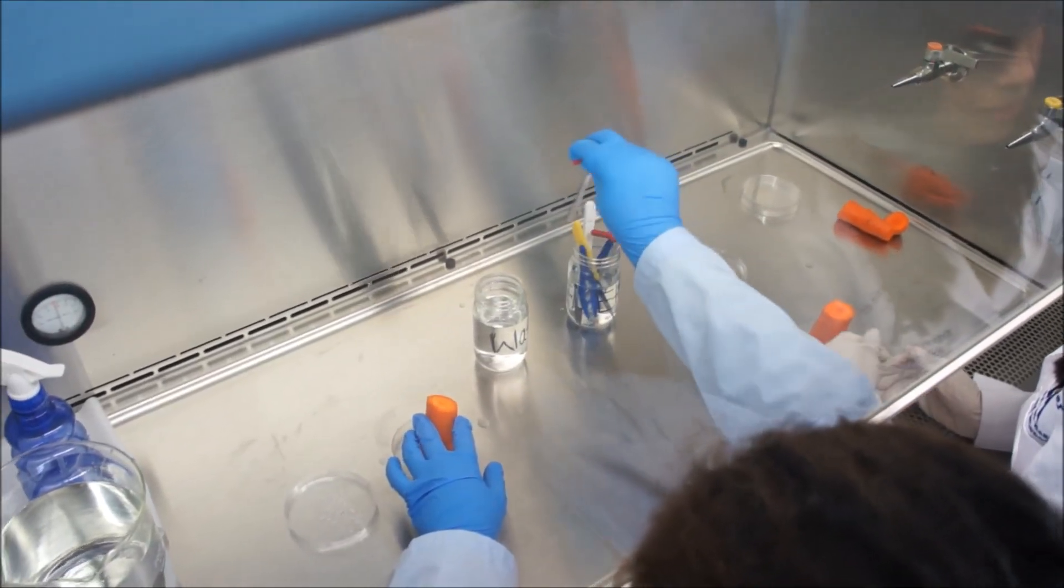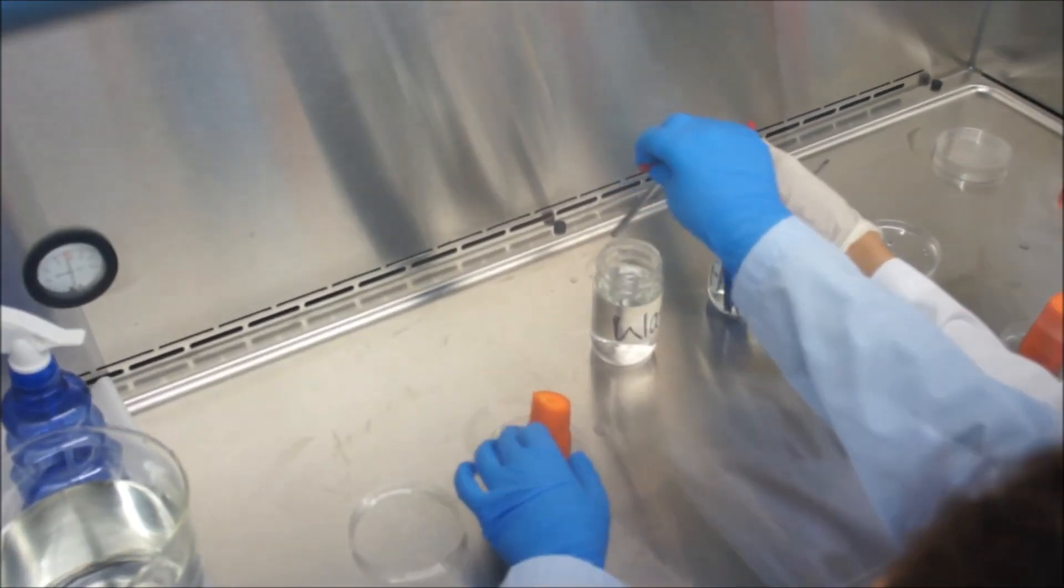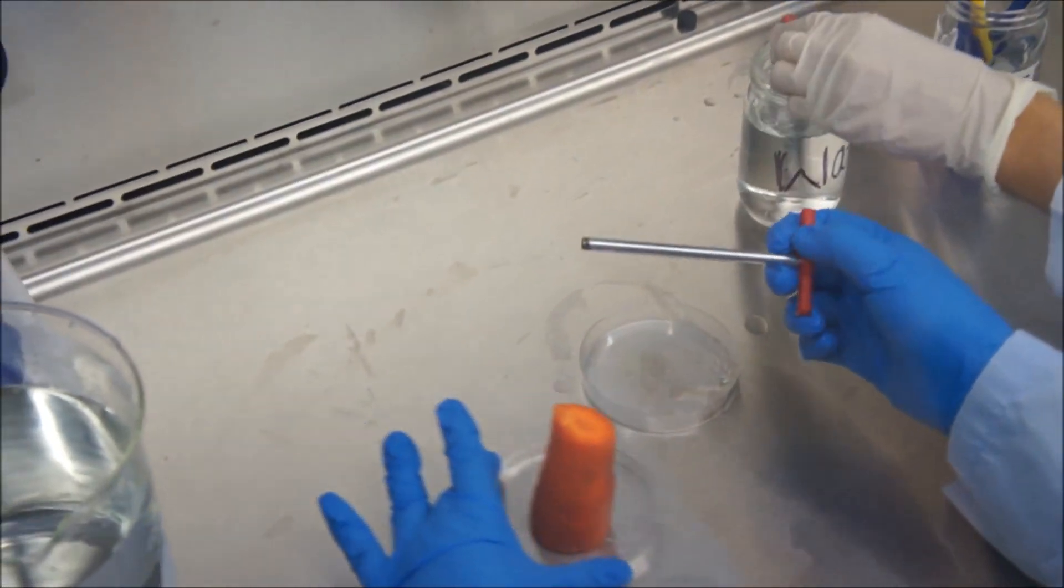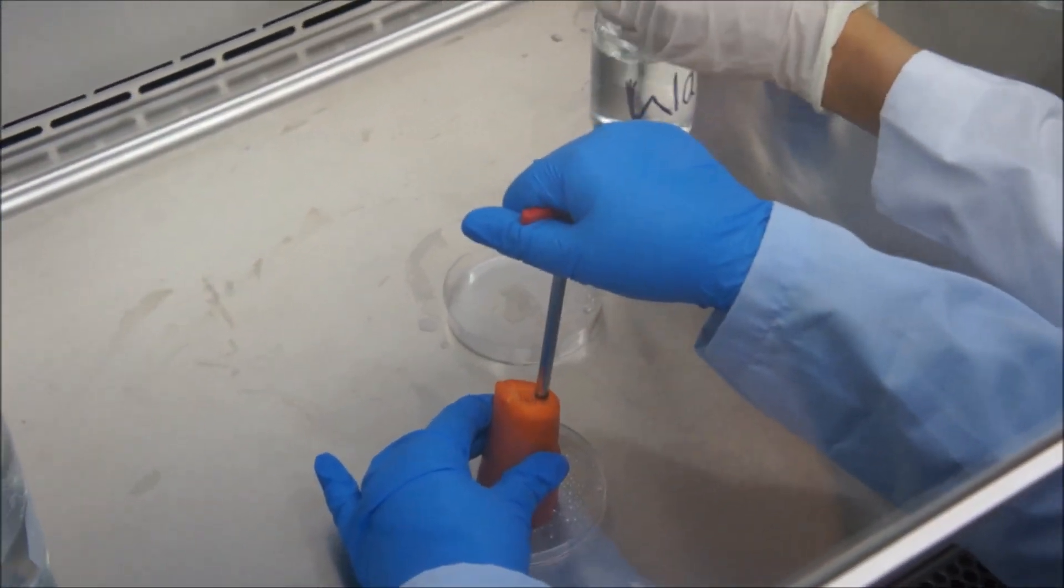Remove the cork borer from ethanol. Wash the cork borer by shaking in a tube with sterile water. Make sure the cork borer has been washed off with ethanol.